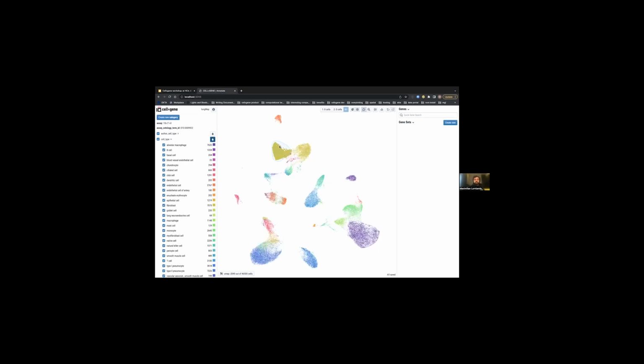So I'm going to go ahead, as Pablo showed you earlier, and select my first population of cells using this lasso selection tool. And I'll go ahead and assign that to group 1. And then I'll do the second population of cells and assign that to group 2. And I'll go ahead and run that. So we're going to run this differential expression on around 6,000 cells.